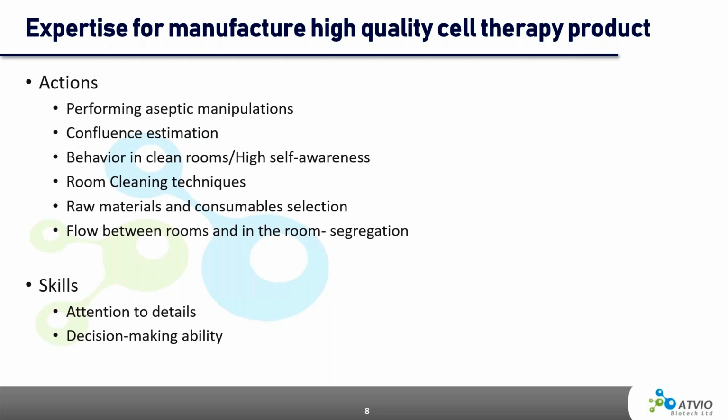Raw materials are also a great example of how GMP affects our daily operation. For example, if you use pipettes, which I believe you do, you can't order any kind of pipette that you want. You need to understand that the quality of the package can also affect the risk of contamination. In clean rooms, don't use pipettes that have a paper side in the wrap, and prefer ones that are individually packaged.